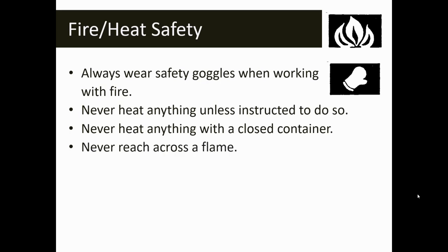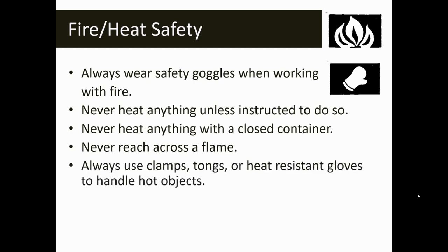Don't reach across an open flame. There are a couple of labs where we'll have open flames — when we get to fibers, there's a lab where we'll light a tea light candle. There's also an unknown substances lab with Bunsen burners, and when we get to arson, there's a project with an open flame. For all three of these labs, anytime you have a flame, be mindful — you never want to reach or pass anything across an open flame.